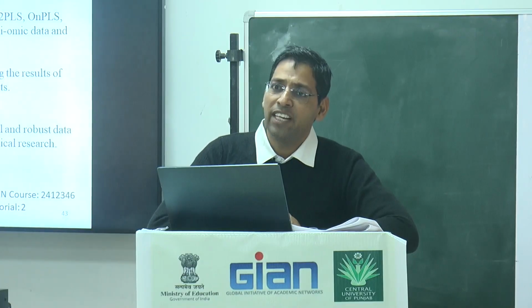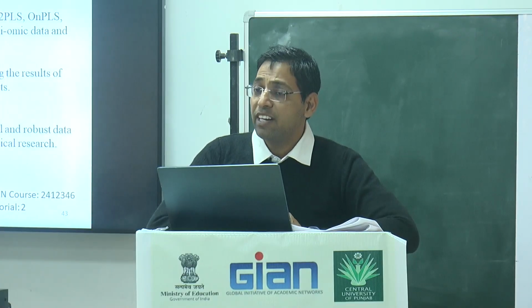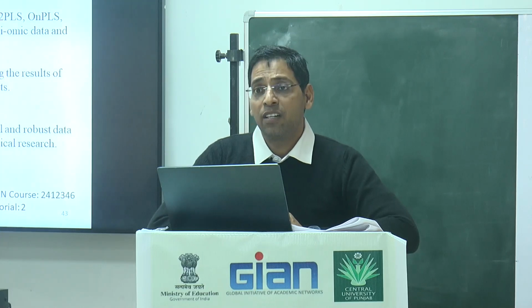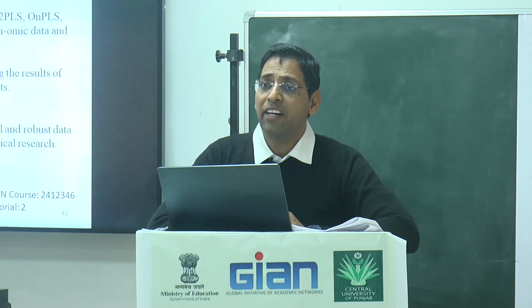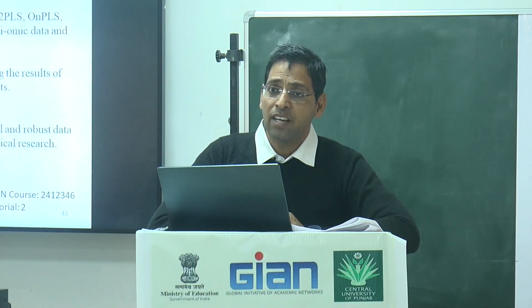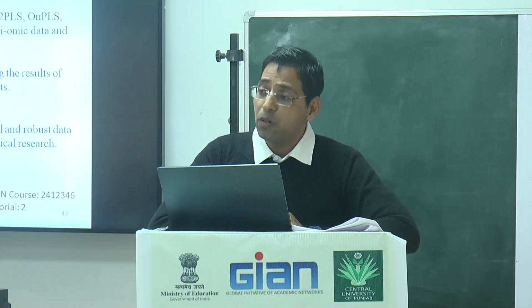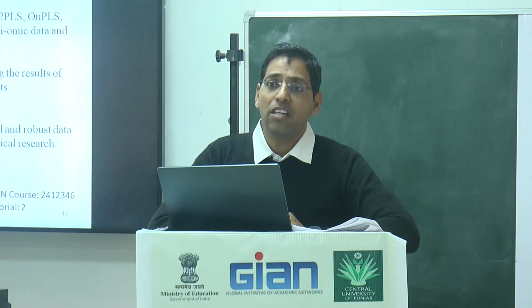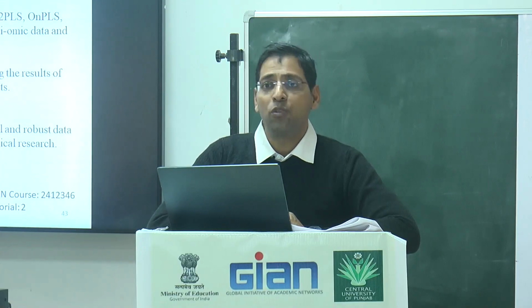So what is the meaning of that science? Whatever databases and libraries are released by different laboratories, it's a very validated approach and they use rigorous exercise so that they have very good reproducibility also. And reproducibility requires extensive interpretation from 0 up to the output of your experiment.